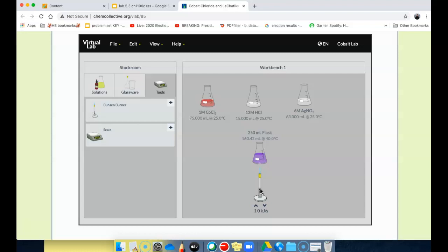Is it changing? We are at 40. We're at 50. You know, I don't see much change going on, right? It's staying bluish. It's not turning to this color. But maybe when it gets up to 90, we'll go all the way to 90 just to see if it changes color. And I went all the way up to 90 something.